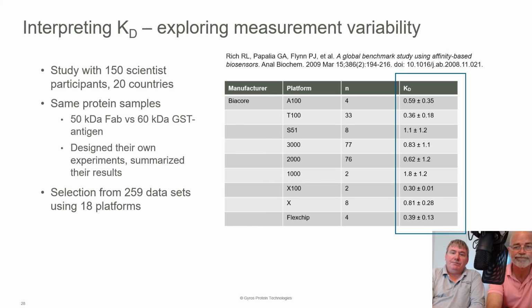Yeah, and as we said in the previous slide, it's really about being in the same ballpark. So absolute number doesn't matter. It's relative, and it is method dependent. It is day dependent. You will get variability in your measurement.